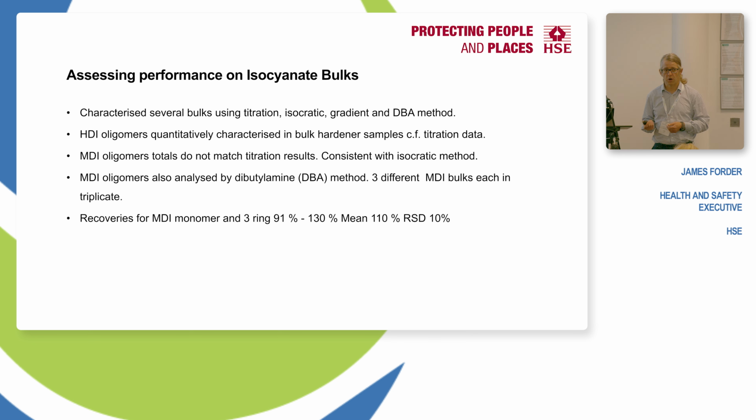So, moving on to final validation. I wanted a range of isocyanate bulks. It's a lot easier to get these from various isocyanate suppliers to test, and you need to prove that you're recovering isocyanate by your method.